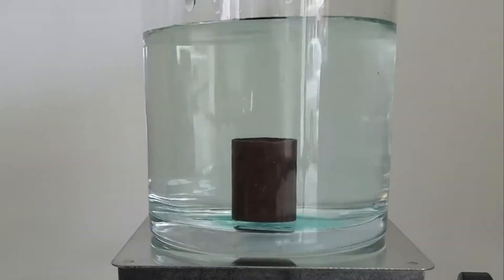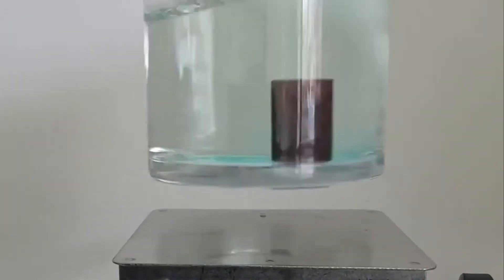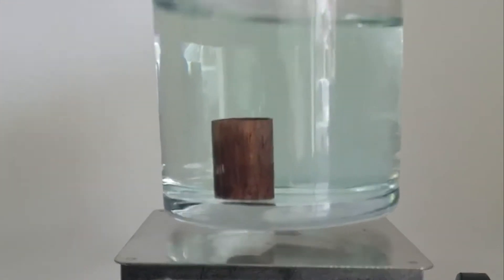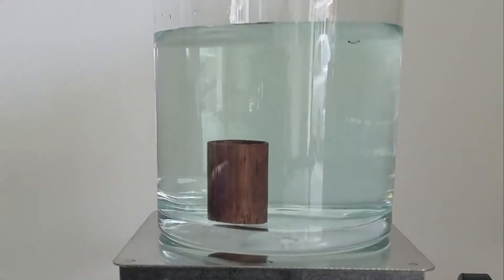Alone, hydrochloric acid will not react with copper, as copper has a higher reduction potential than hydrogen, and thus hydrogen in hydrochloric acid cannot be reduced from the 1-plus oxidation state to the 0.